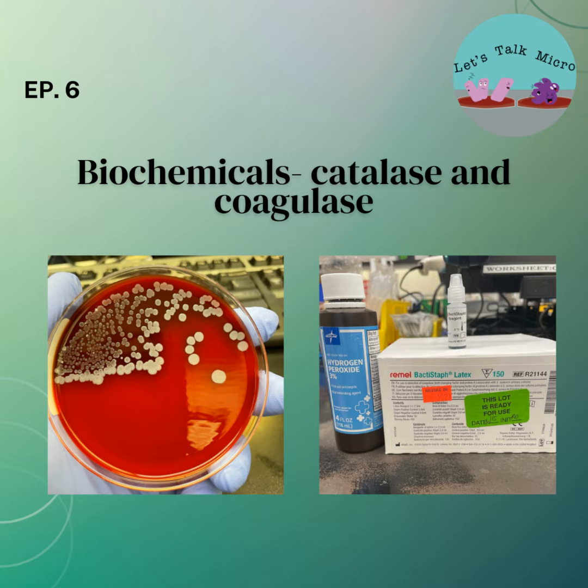On a negative result, there's no clumping, or maybe you may see one or two clumps with a murky background. Having met the right criteria, meaning a beta hemolytic, coagulase positive, that's good enough to call it Staph aureus. And if it's non-hemolytic and coagulase negative, it is good enough to call it coagulase negative staph.